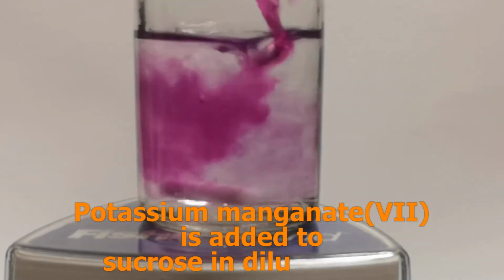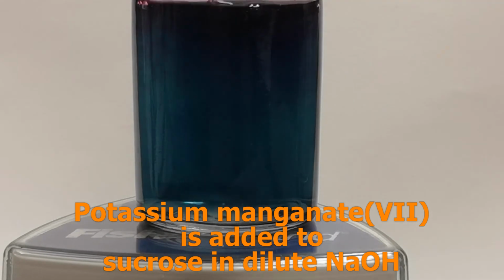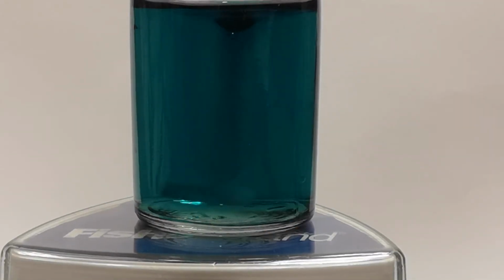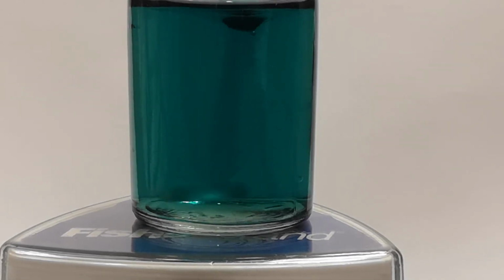Manganese has even more oxidation states, from 2+ all the way up to 7. There is no single experiment that can show all of them, but this is an interesting and easy demonstration of 3. It is called the colour change chameleon.